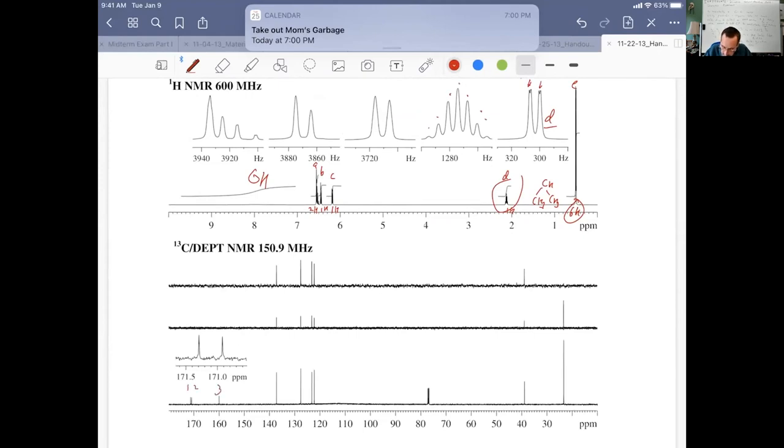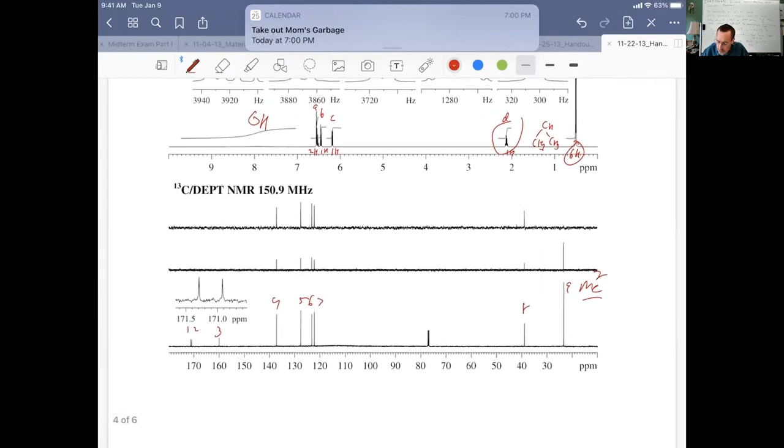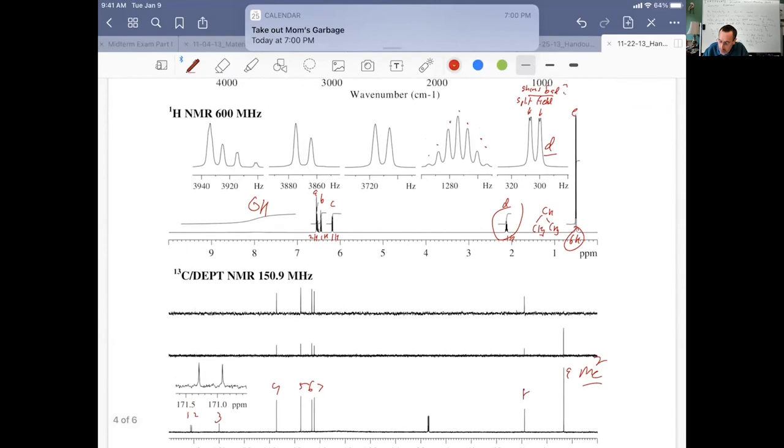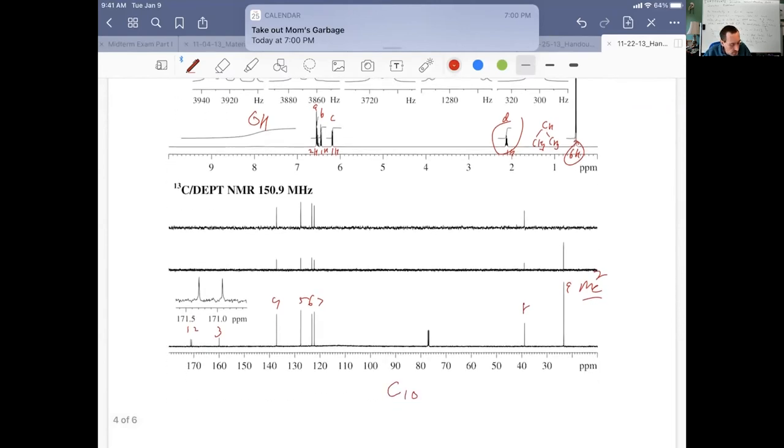We see something that looks like a septet here. It probably doesn't take too much imagination to think maybe we have an isopropyl group. Clearly with six hydrogens here, we have two methyls that are the same. If we go to the carbon NMR and try to count our way through the carbons, we get one, two, three, four, five, six, seven, eight, nine. This is a methyl group here. And I've already said that we have six hydrogens. So it's got to be two methyl groups.